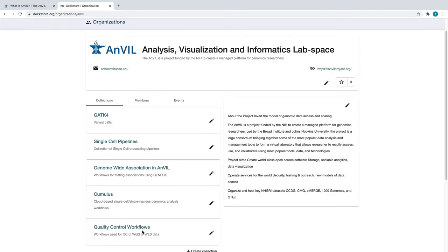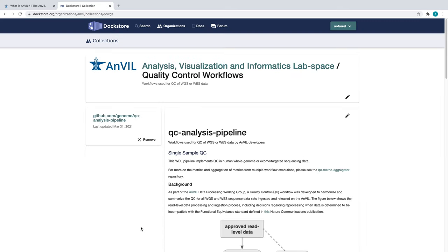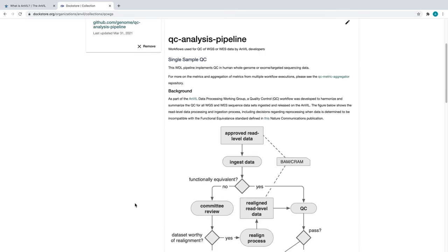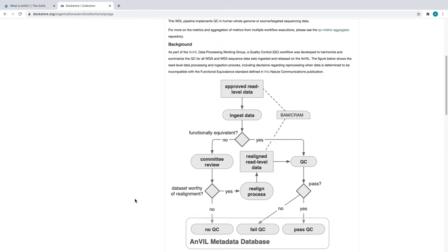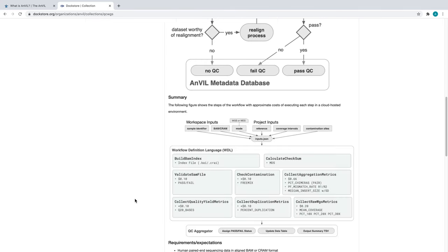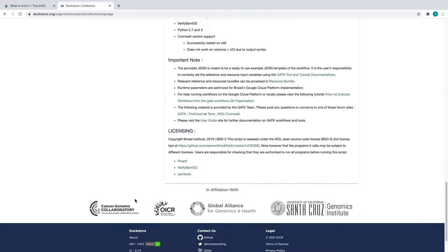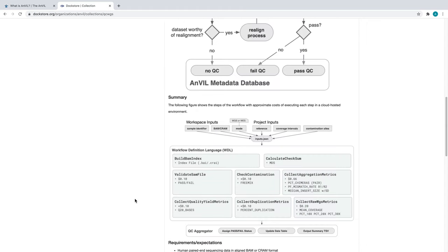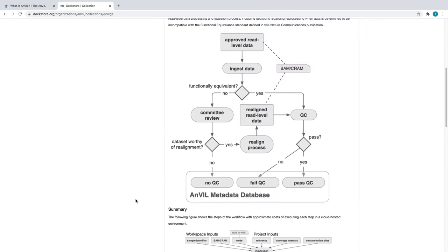Let's go for this workflow. On the subpage of the collection page, we can see more information about the pipeline. I won't go over the entire thing in the interest of time, but this is a pipeline for running QC on human whole genome, exome, or targeted sequences.